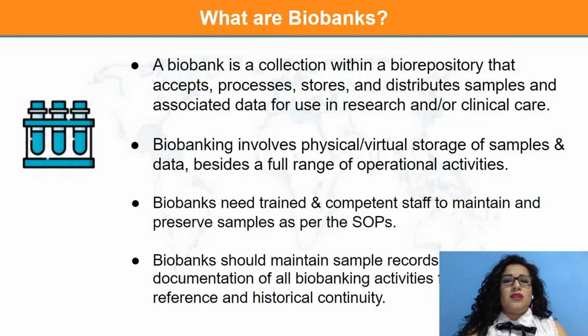For example, when they are developing treatments for several diseases, or when they are studying genetic changes that may increase a person's risk for several illnesses like osteoporosis, asthma, or some cancers. The role is to store these collections and to keep biospecimens in a safe physical location while maintaining quality so that researchers can access them and the data associated with these biospecimens.